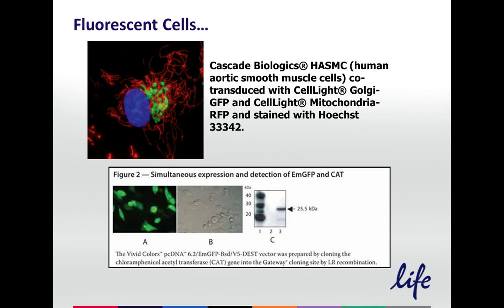Now, since that initial GFP characterization, there have been a lot of other fluorescent proteins that have been identified, for instance, from corals and other animals, as well as derivatives of GFP. For instance, now you have yellow YFP or cyan CFP. And researchers like Roger Tsien, for instance, have really helped in the last 10 years to broaden the palette of fluorescent proteins that are available, ranging everywhere from blue up to far red. And every year they get better in terms of options for fluorescent proteins that won't photobleach as much or are brighter.